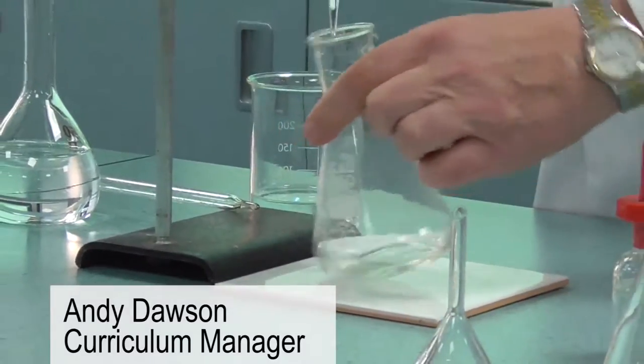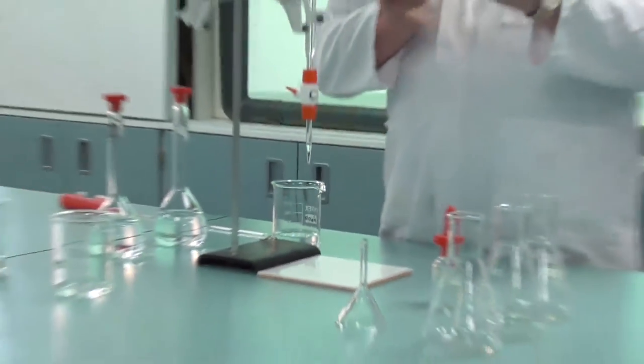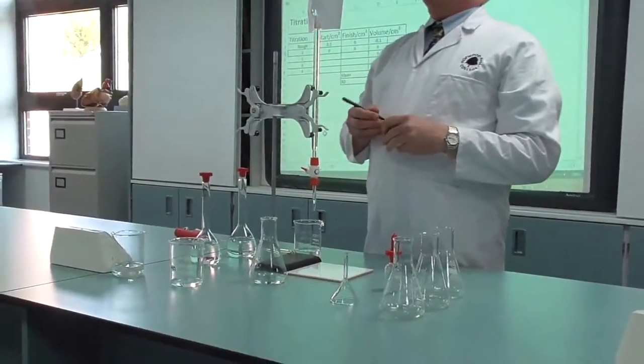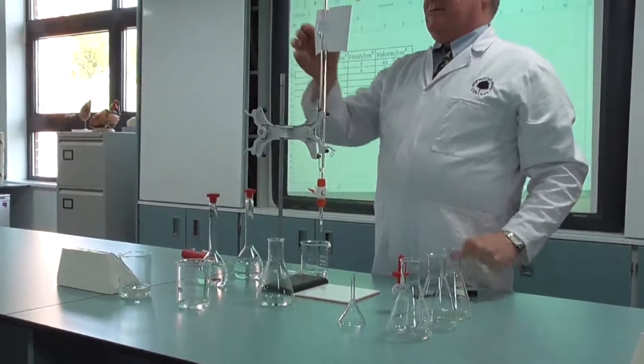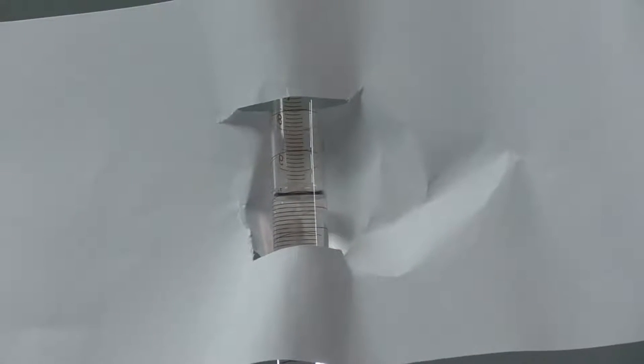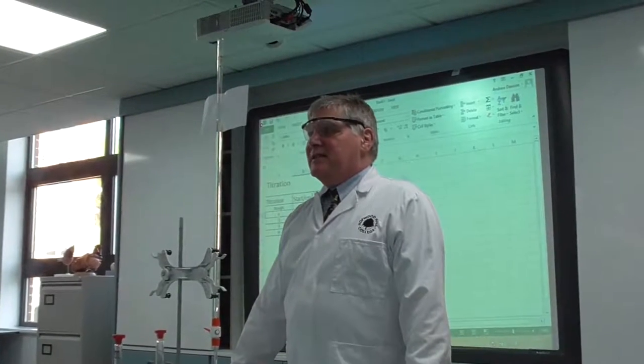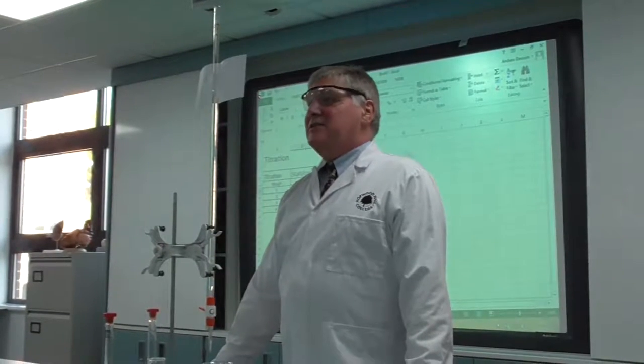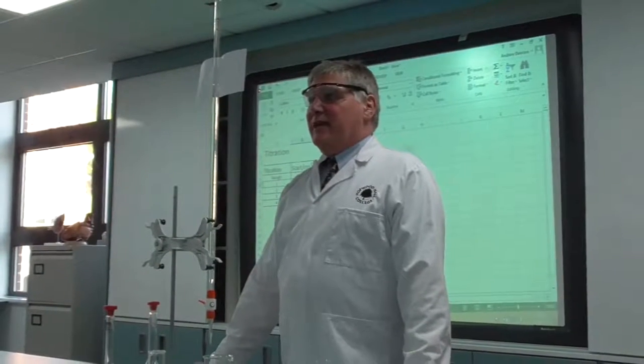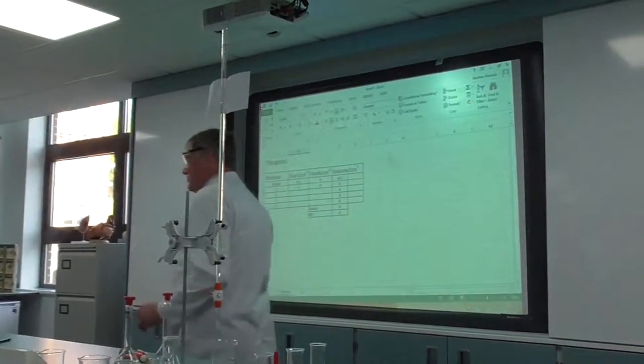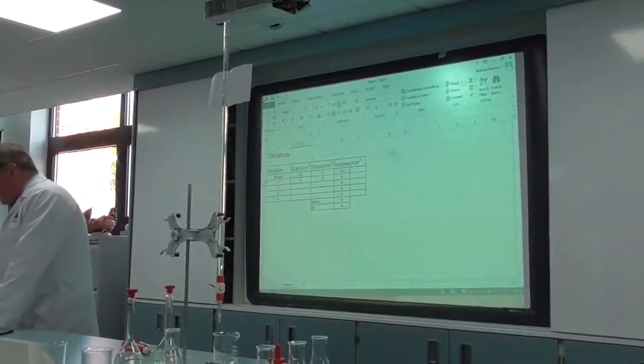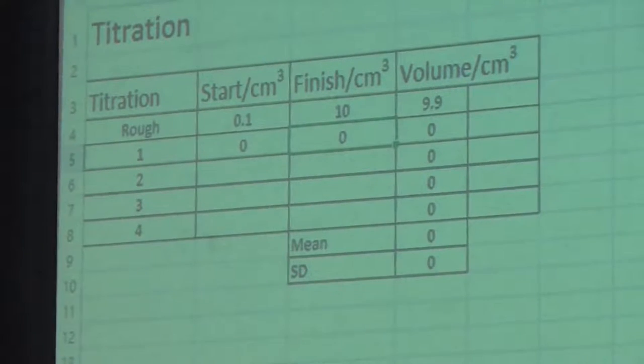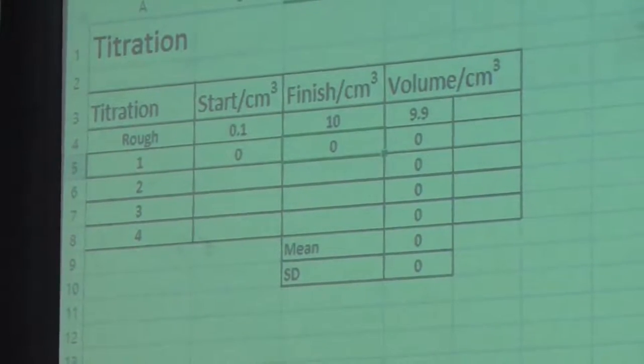Very importantly, we need to mark the conical flask for the rough one and keep it by the side. We're reading off here the endpoint is exactly with the meniscus on 10 centimeter cubed, so we need to add that to the table so we don't forget it and don't get confused. I put this into the spreadsheet: 10. We can now see that the volume used is 9.9.